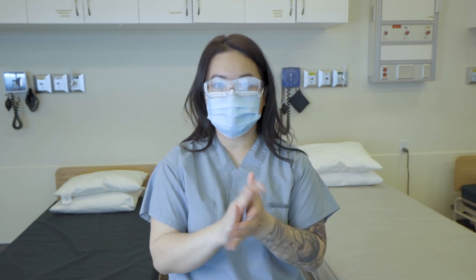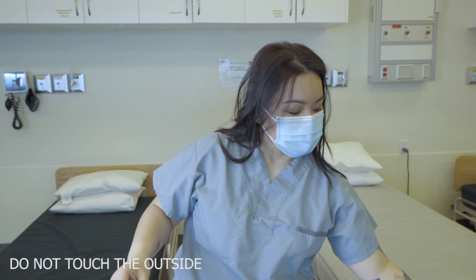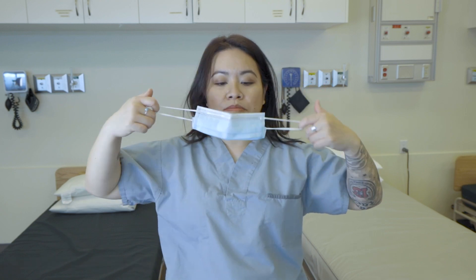Again, hand washing may be necessary at this point. And then we would remove our goggles without touching the outer part of the goggles, and same thing with the mask.